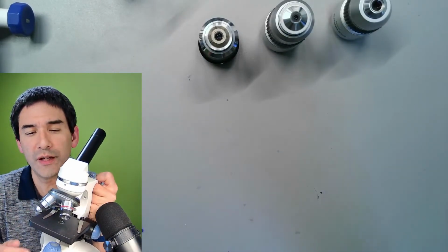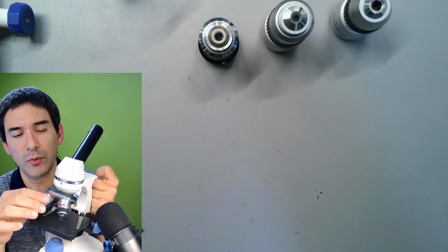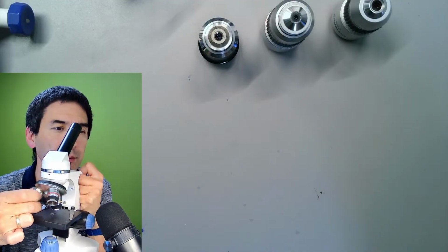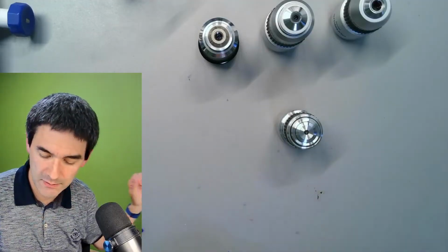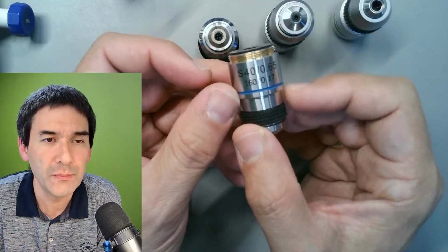And in order to do that, because I don't always want to hold up the microscope, I'm just going to take one of those objectives out here, simply to show it to you as well, because I would like to compare them. This is the one that I just removed from the introductory microscope.